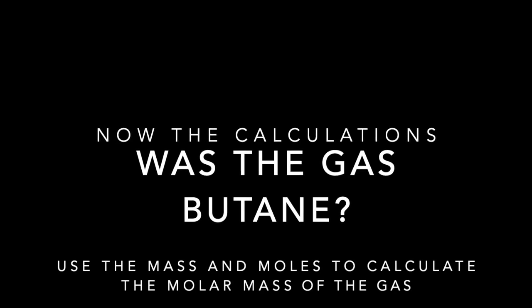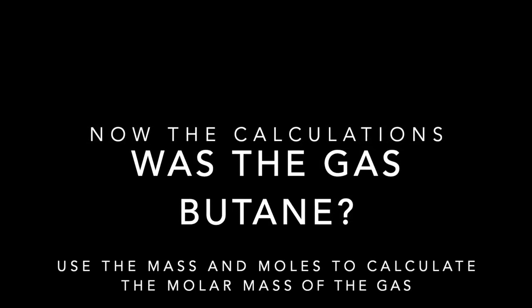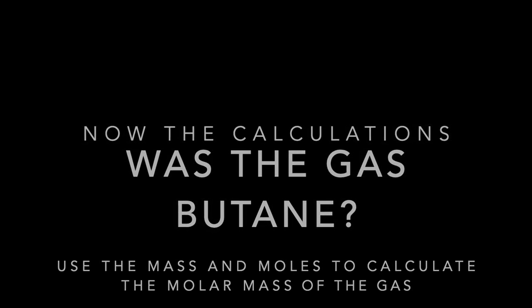Now onto the calculations. Was the gas butane? Find the mass and the moles, and you'll be able to calculate the molar mass of this gas and see if it is indeed butane.